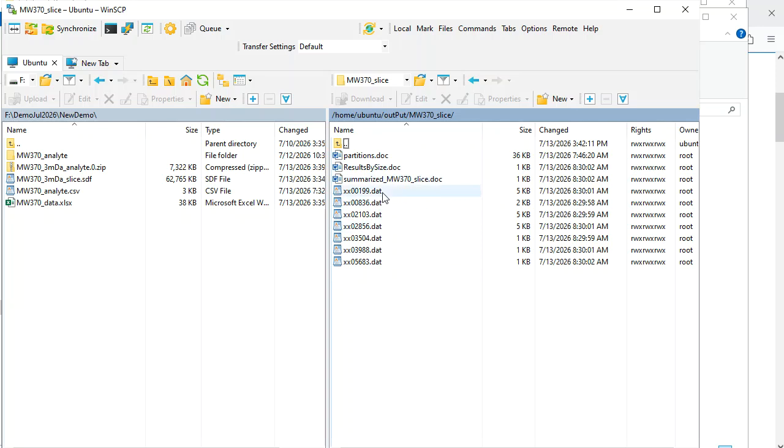These each represent, we had 8,870 compounds listed in order of relevance, and these numbers are from 0 to 8,869 for the compounds. So these numbers show how relevant each compound was.